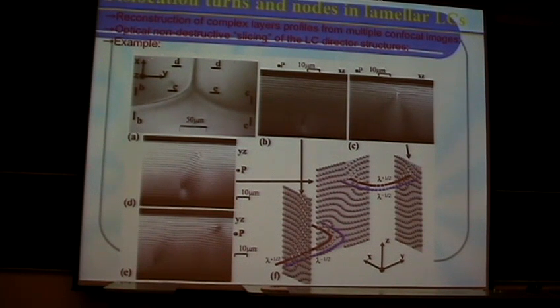And so, again, in conventional microscopy one would only see a two-dimensional view of such a complicated structure, but in confocal microscopy we can obtain in-plane sections and also different vertical cross-sections depicted here by those different lines in different directions, like for example B and B would be this one, C and C would be this one, and so on.